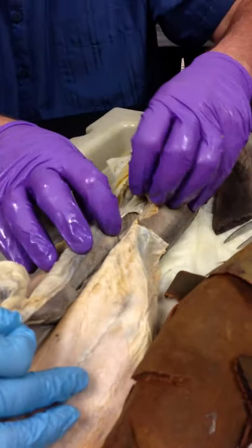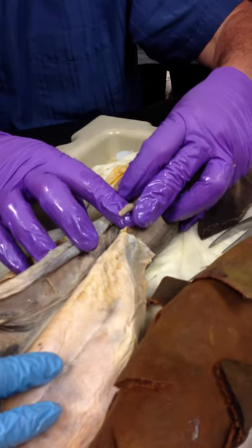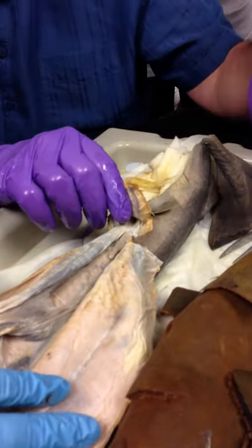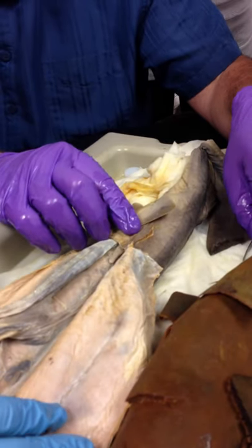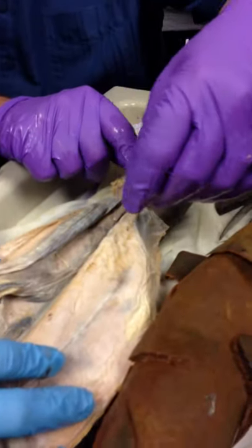And then, back here by the rectum, we have a gland called the rectal gland. It does chemical communication, so when this shark takes the poop or pee, it squeezes that into the poop or pee, and other sharks come around and go, oh yeah, Maggie was here. I don't know if her name is Maggie, but that's what they say. It is now. It is now.